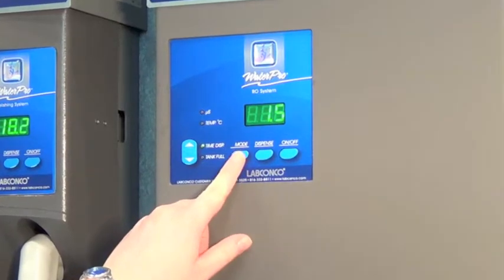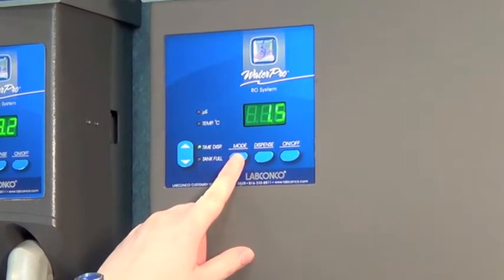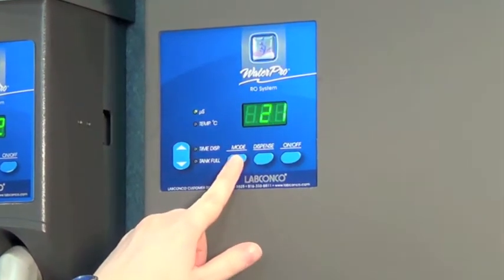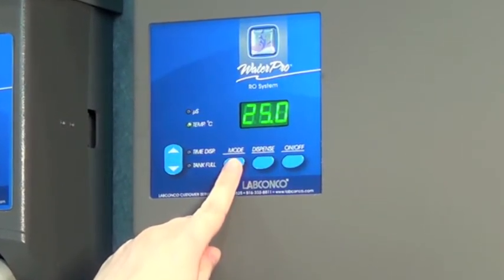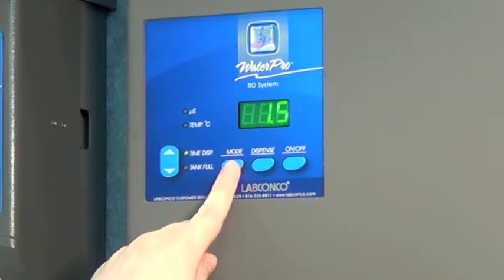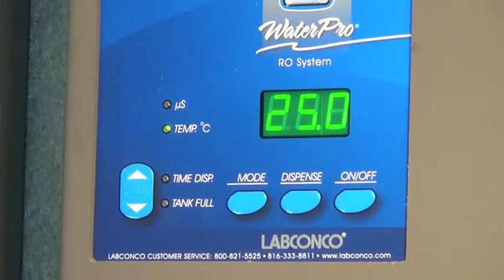Pressing the mode button allows the user to toggle between display modes to see the water purity, water temperature, or the current time dispense setting. The lights on the left indicate which mode is currently selected.